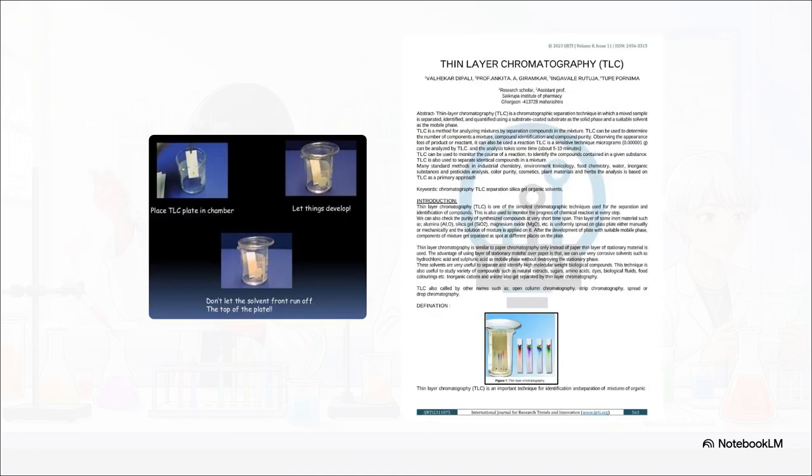And here is where we get that elegant progression of the plate developing. We place the spotted plate into the closed chamber, and slowly, silently, the solvent begins its ascent. It's drawn upwards entirely by capillary action, fighting right against gravity. As that solvent front moves up, it carries our separated compounds right along with it.